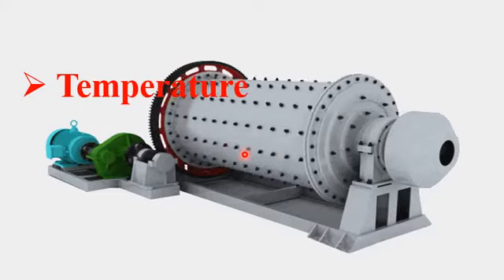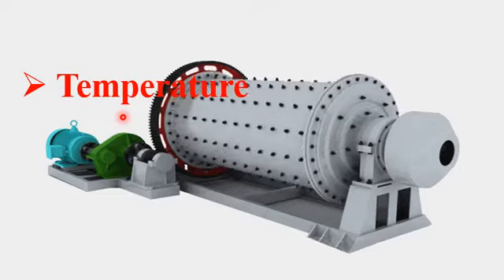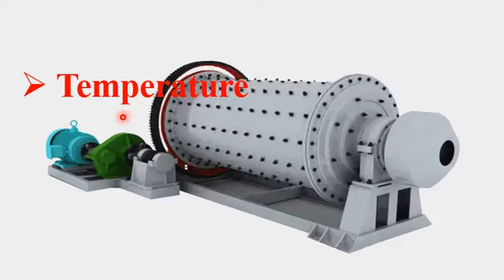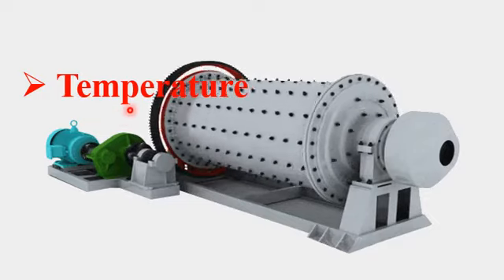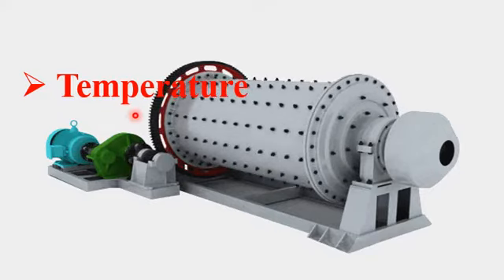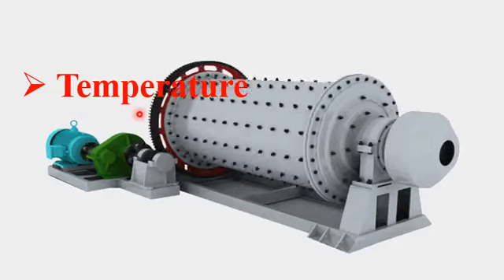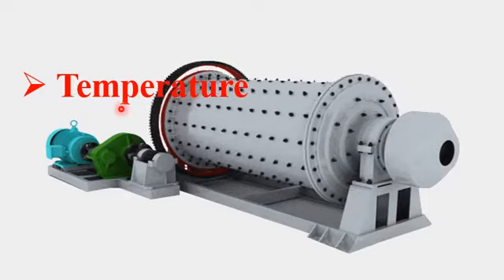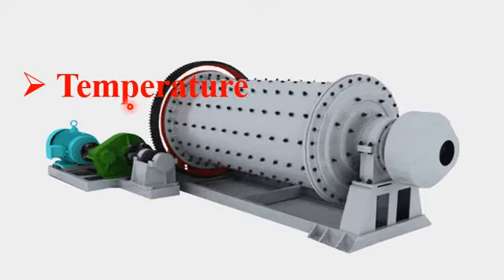Since you know that ball milling is a kind of grinding method that grinds bulk material into very fine nanoparticles, during the milling process there usually takes place a collision between the milling balls and the bulk material.